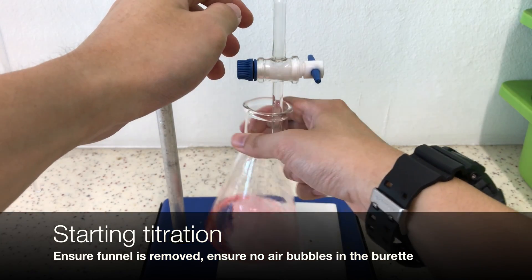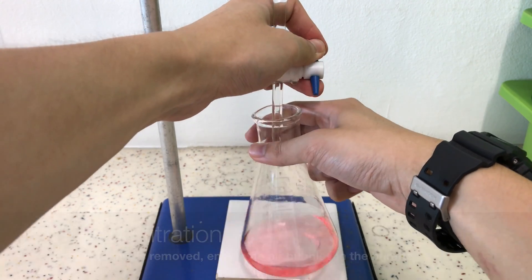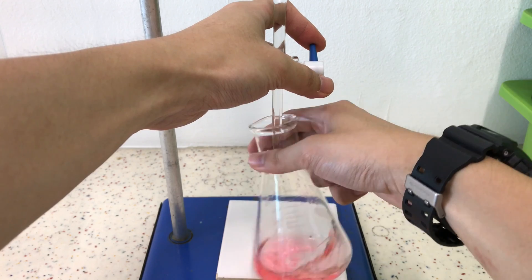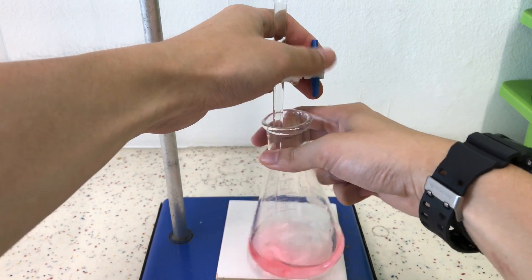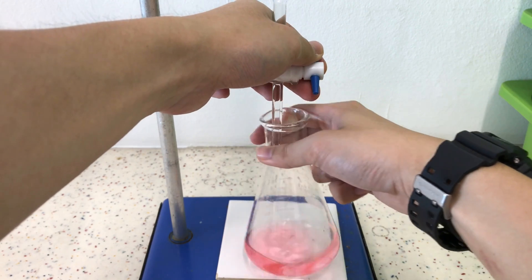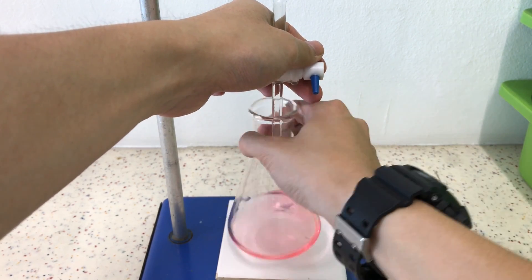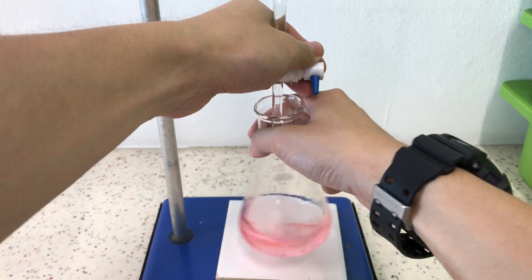Now here comes the fun part. To start the titration, we will swirl the conical flask in one hand and in the other hand we open the tap to allow the titrant to flow into the conical flask. In the beginning of the titration, we can add the reagent rather quickly with constant swirling.